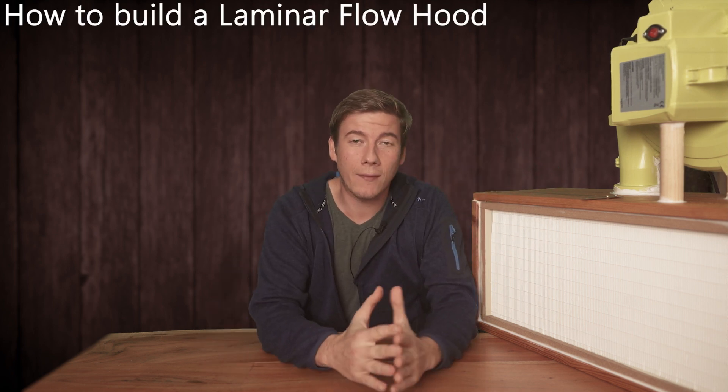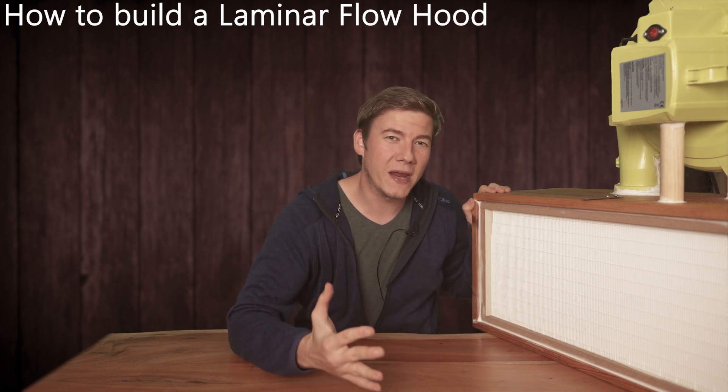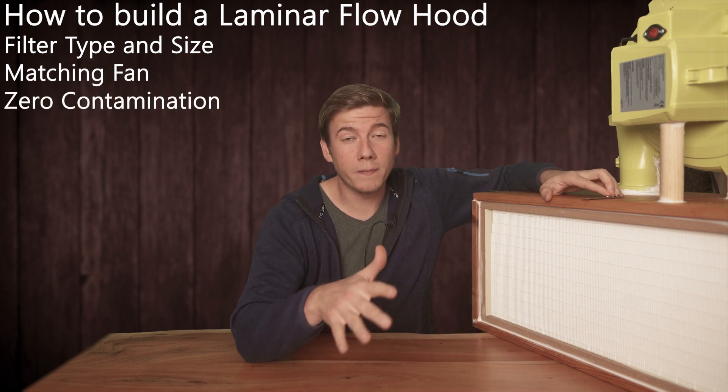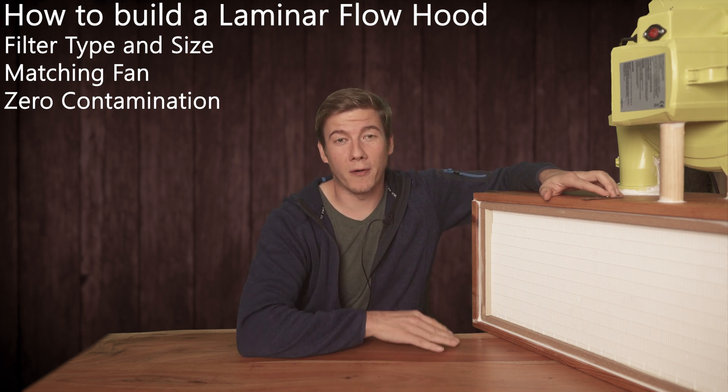Hey, I'm Jens and welcome to my YouTube channel Happy Mushrooms. Today I'm going to share everything I know about how to build a cheap DIY laminar flow hood — how to build this thing, what kind of information you need to collect before. Think of planning a laminar flow hood like this so that you'll be able to build your own laminar flow hood matching your personal needs.